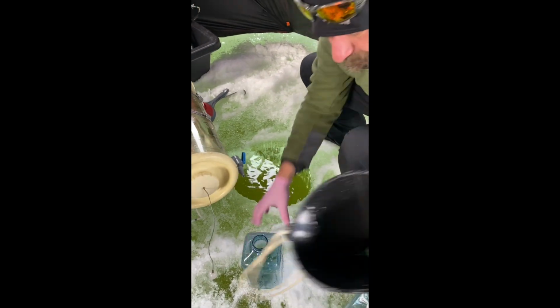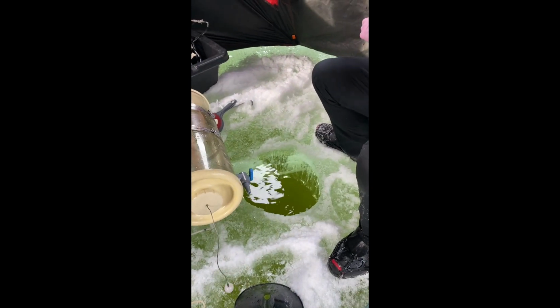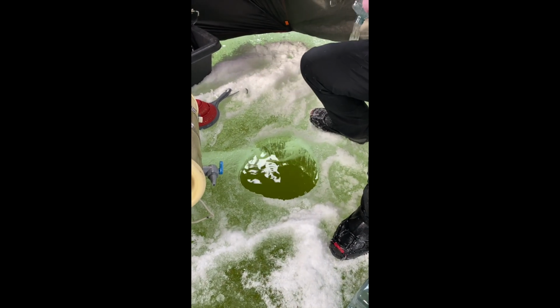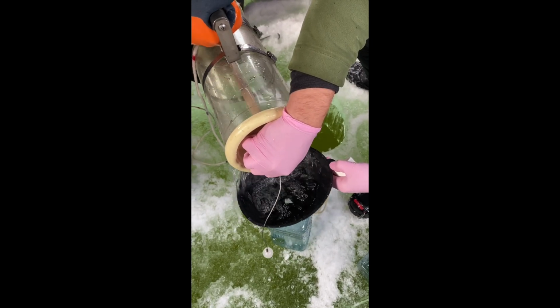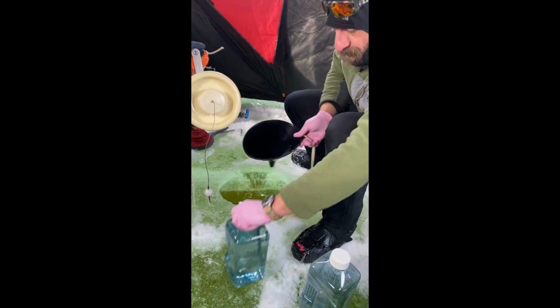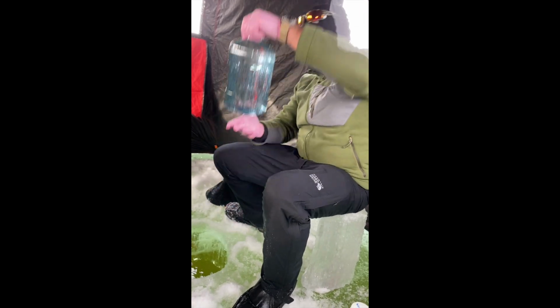We have a lid somewhere, I'm sure. Oh, there it is. And we do the same thing with the rest of the bottles from this depth, and then move on to our mid depth, and then do our deepest site.